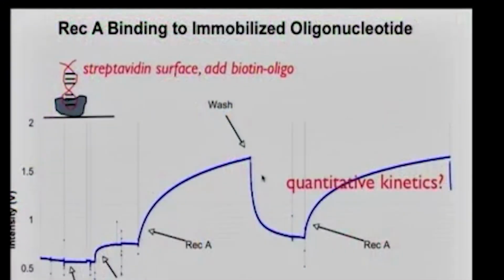Yeah, and I know that the SPR instruments come with associated software. Now, if you're actually trying to study a specific system, it may or may not be the right model for your system. In this case, you can actually write down the equations and do your own fitting of the data, in order to extract real quantitative kinetics. So in this case, as long as we're reasonably at a certain range of concentration, the intensity is linear with concentration, and therefore you can actually model the kinetics nicely.